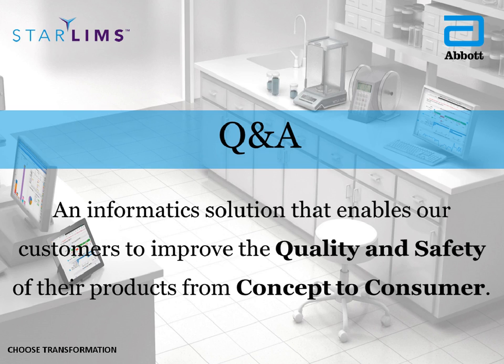Great, thank you. We have time for one more question. So, how does STARLIMS handle aliquoting when it's done by an automated system like the Hamilton?